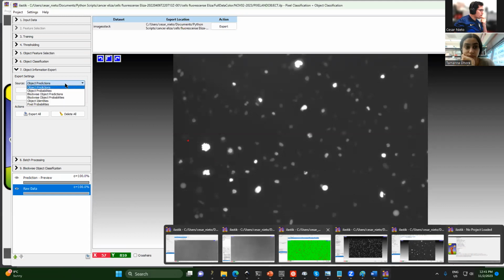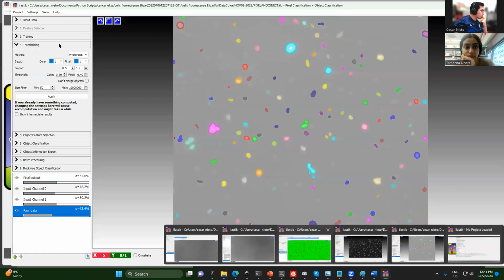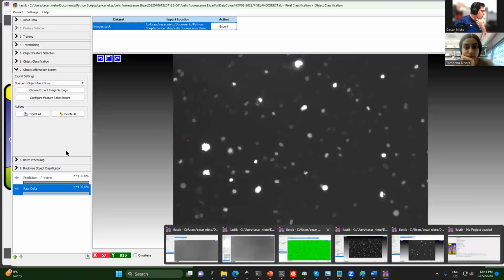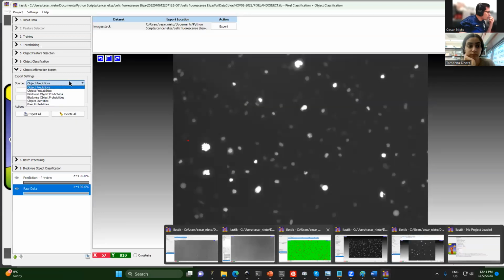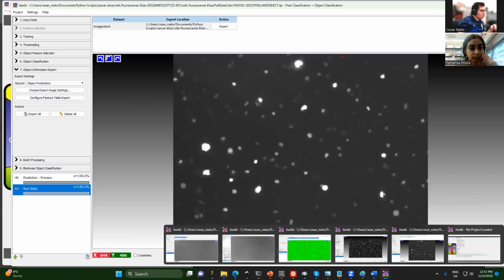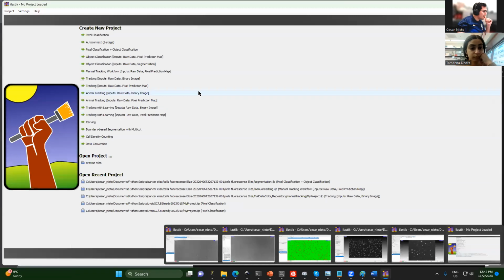I don't know if you need the thresholding file as well. The what? The segmentation file. Okay, so let's see. This guy.